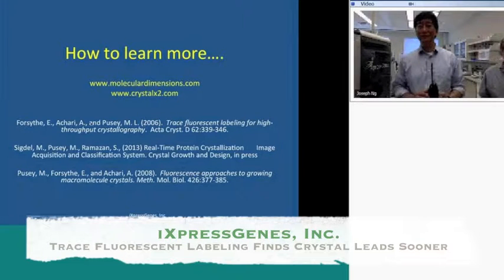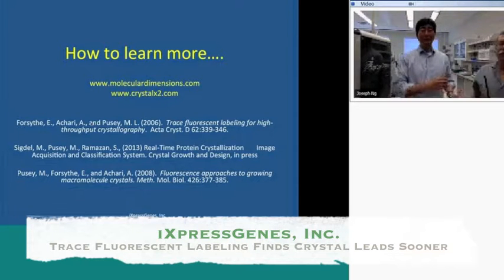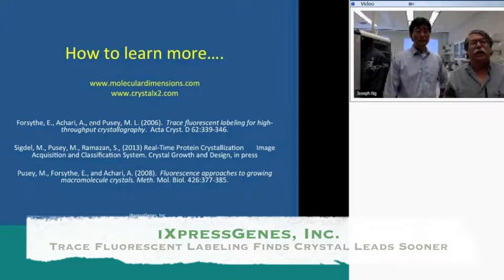Hello, this is Herman. I have a question. Are random amino acids labeled or specific amino acids being labeled? The question is, is the label random, or can you specifically label to a specific location? If you have a particular location that you want to label, you can probably target it.